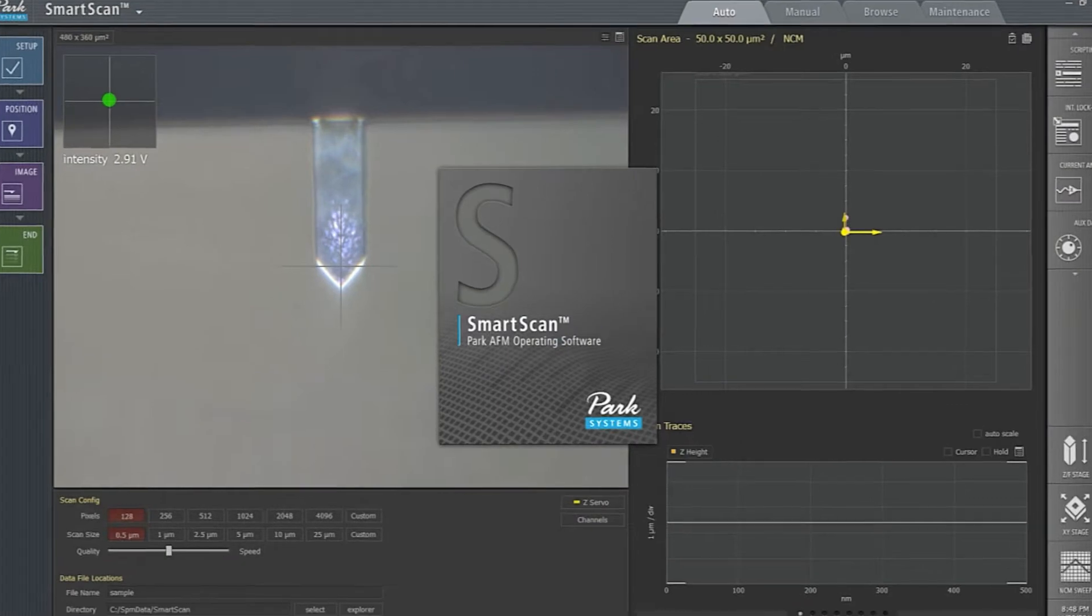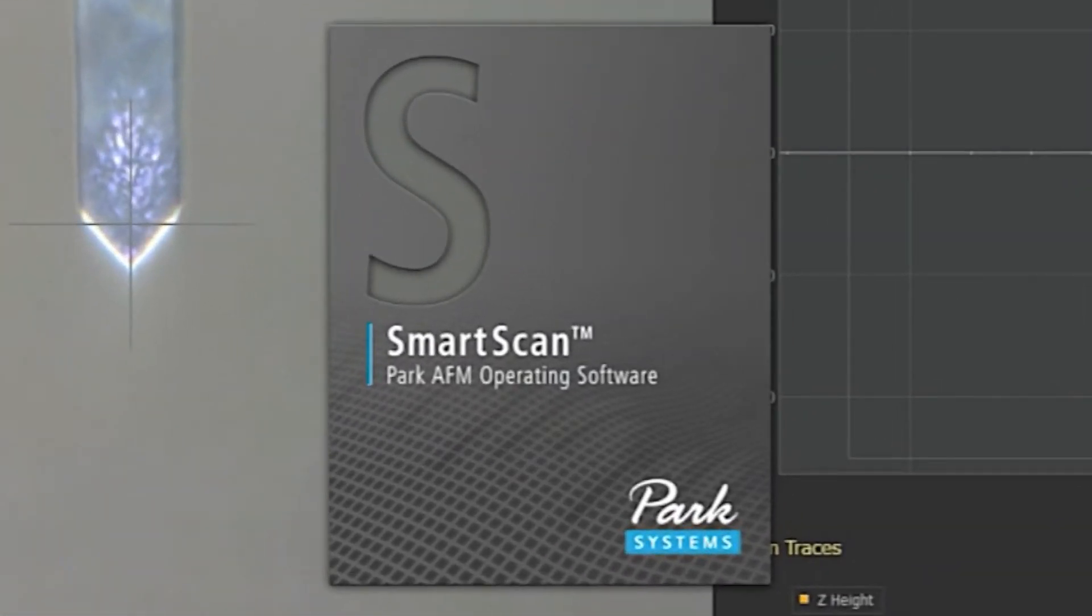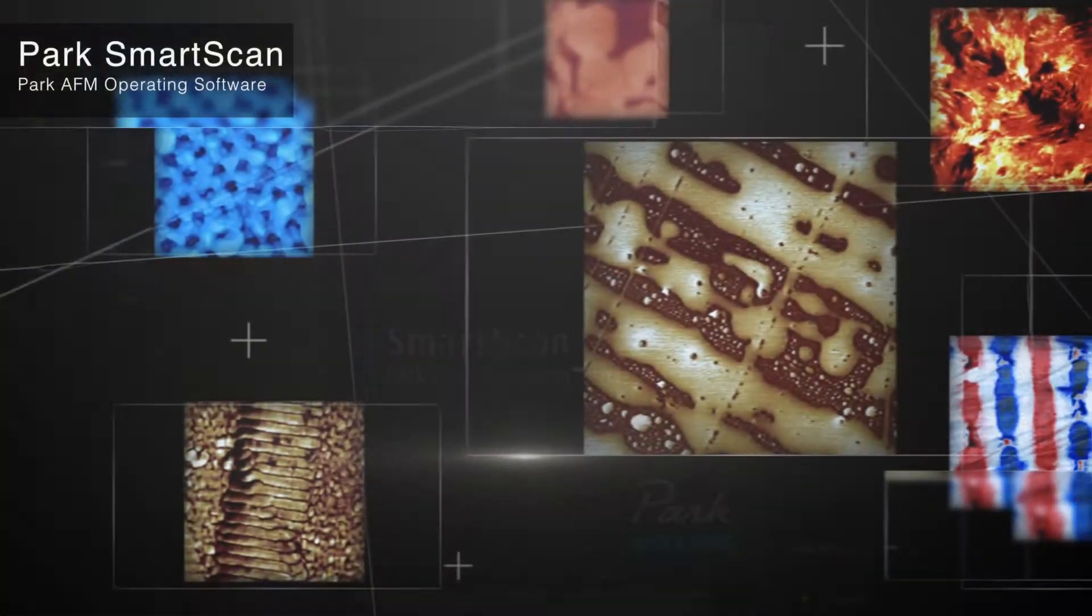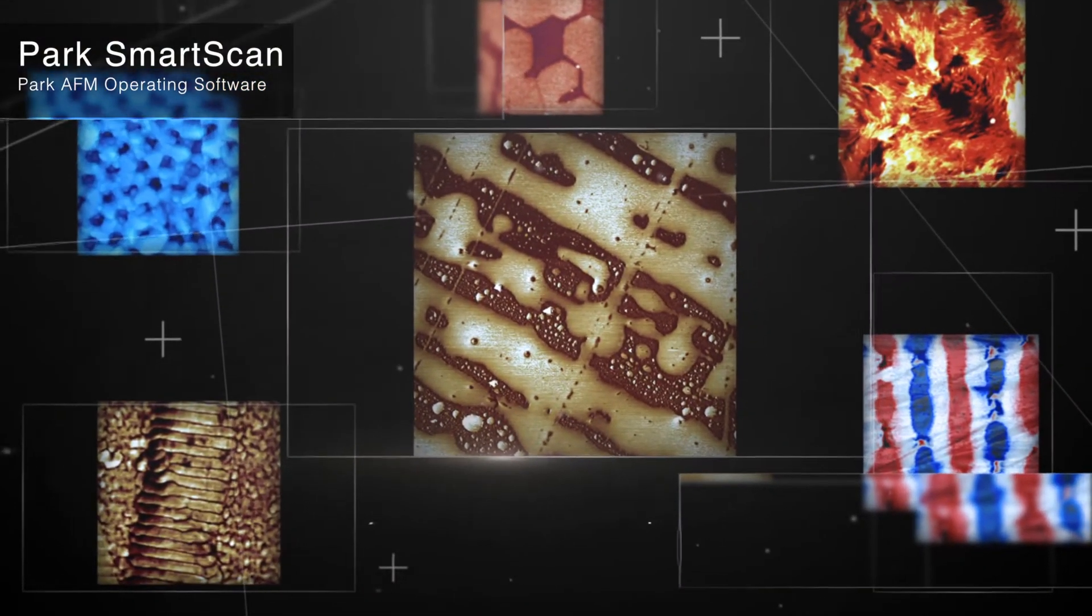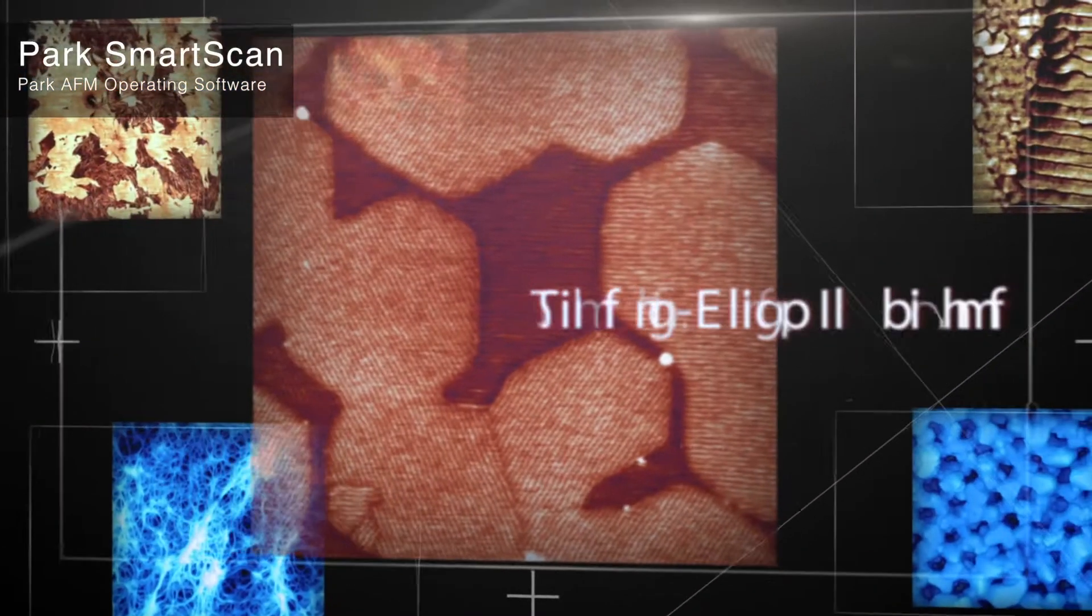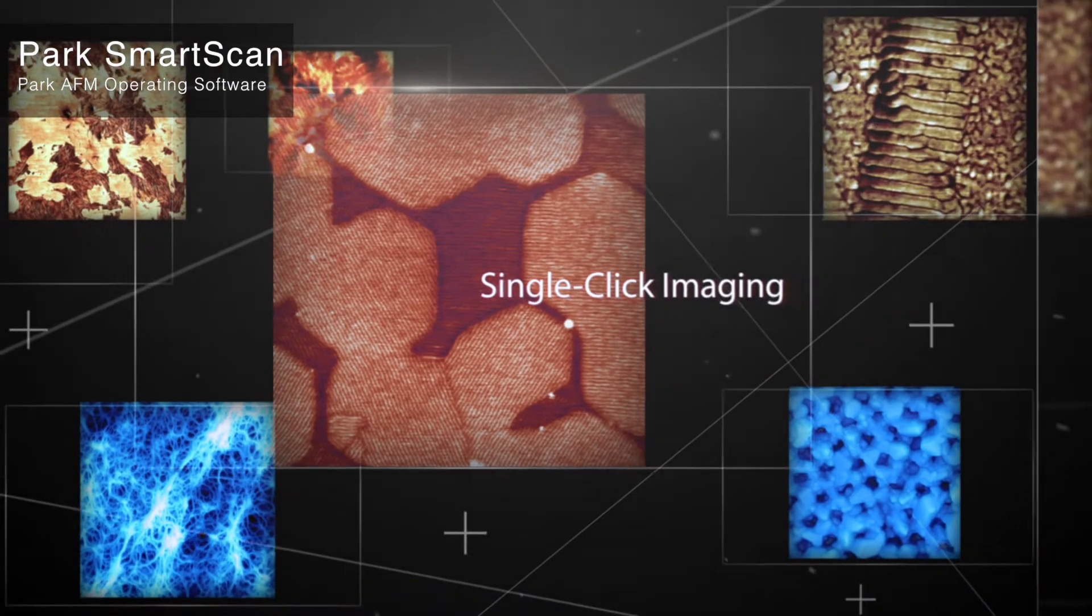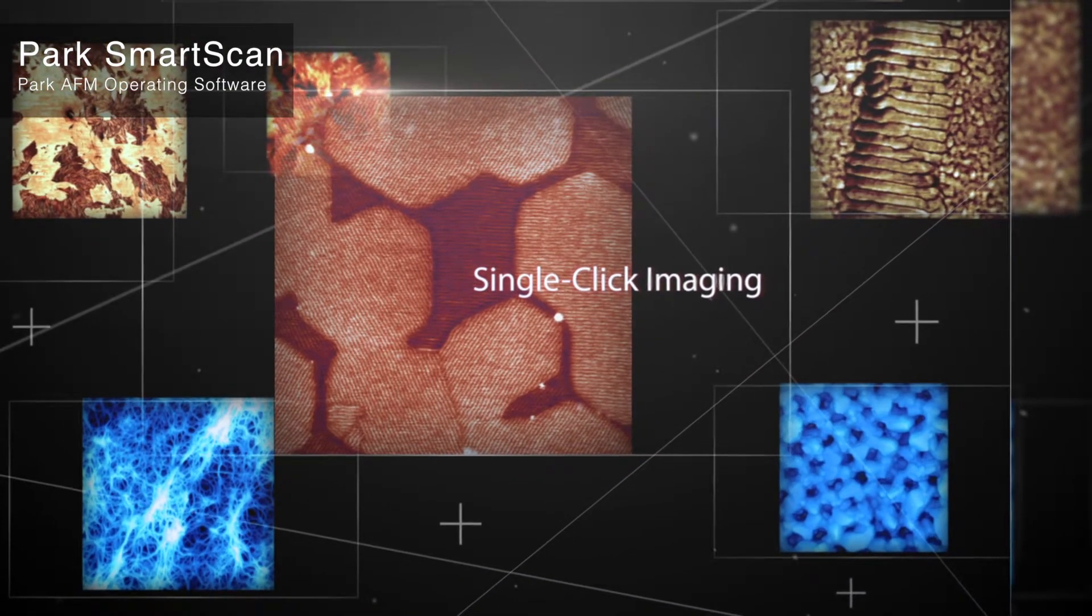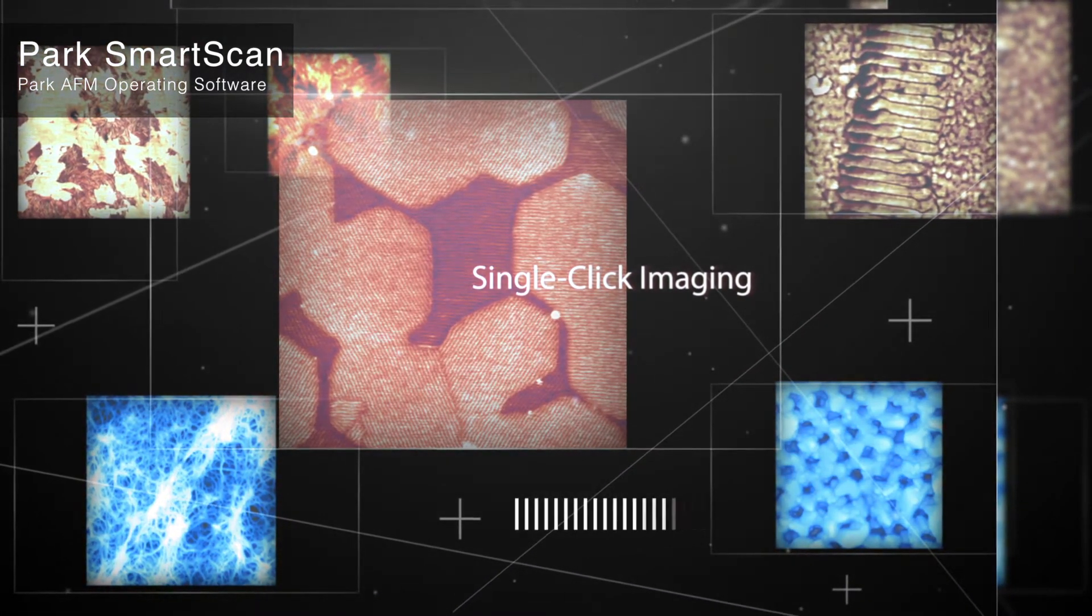Introducing the ParkSmartScan AFM operating software from ParkSystems. Most AFMs require a complicated operation from the user. With ParkSmartScan, all the user needs to do is engage single-click imaging with the software's Auto Mode.